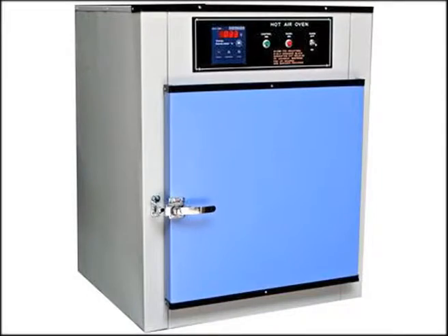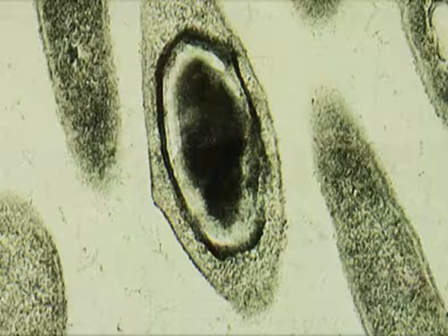Next, we will see the use of dry heat in the hot air oven. A hot air oven uses dry heat for sterilization, but we all know that the penetrating power of dry heat is very low. That is the reason we need a very high temperature and a longer exposure time to achieve complete sterilization, or removal of viable cells as well as endospores.